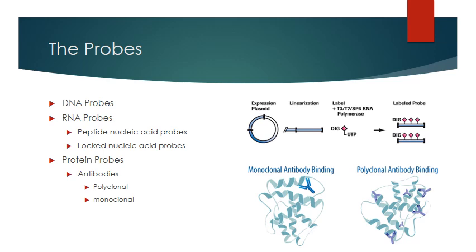Those nucleases are normally present in your cellular material. So these are specialized probes that are produced to protect the probe from specimen material that might be present in the test environment.